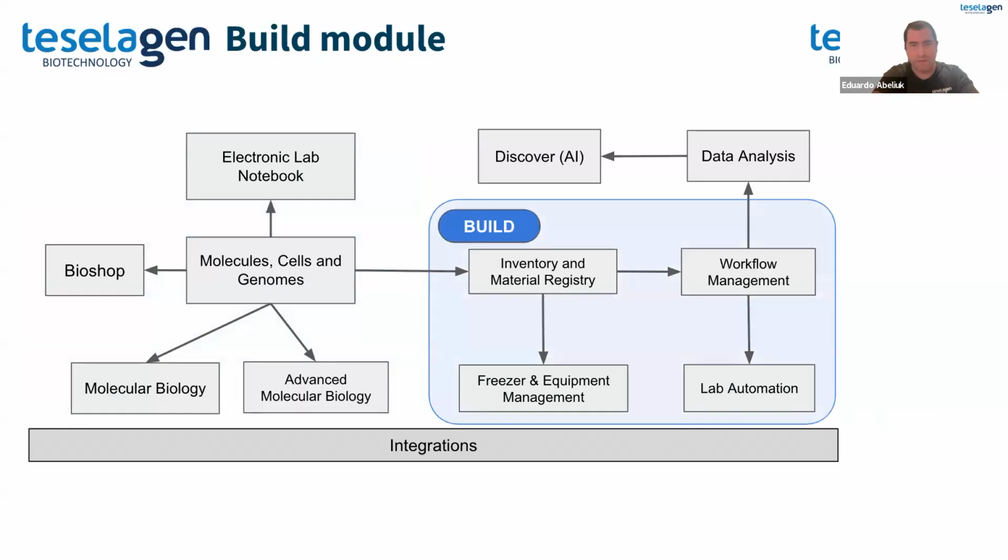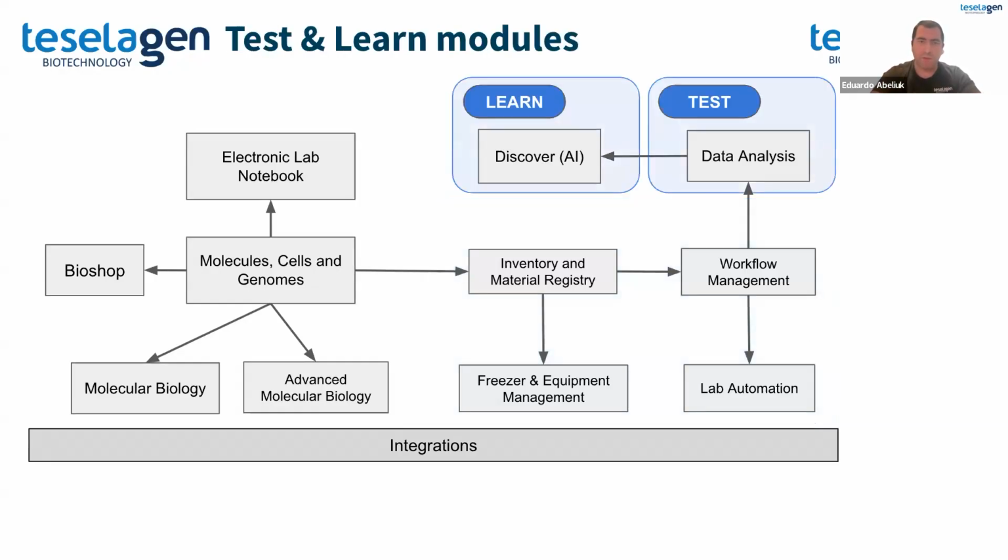And we also have another set of tools and toolkits that are useful for tracking physical inventory, planning and running experimental workflows, which are particularly useful when you need to be ready to scale up your experiments in terms of number of samples being tracked, throughput of experimental workflows being run, or simply automating certain processes within your workflows. And finally, we also have some toolkits for ingesting experimental datasets into our platform, parsing and organizing those datasets, performing statistical analysis, visualizing the datasets, and using the datasets to train more advanced AI models.